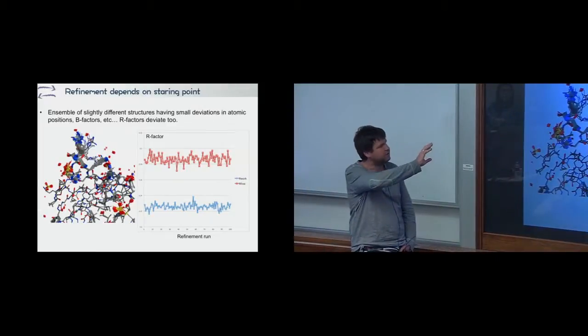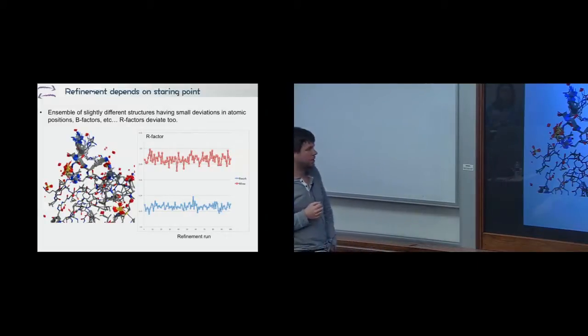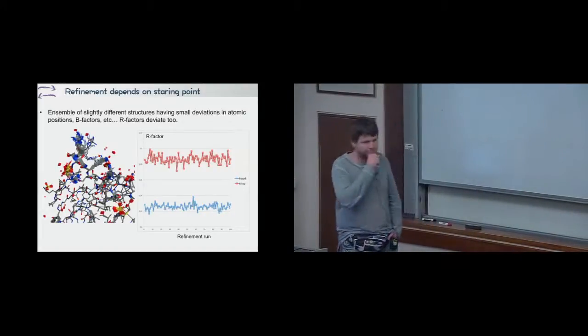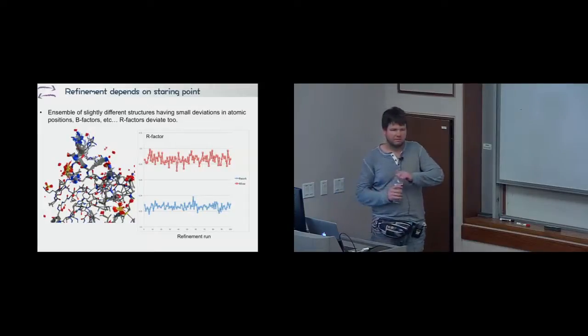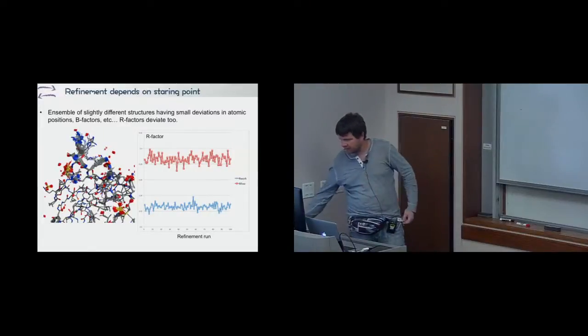And so the differences may have two sources: refinement artifacts, instabilities, and capturing something actually real. But probably that region has bigger B factors and it's less well determined. So the conformation fell into a slightly different local minimum in each case. Exactly. It doesn't mean that those are conformations that exist in the crystal. It just means they're accessible to refinement and fit the data. That's very true.